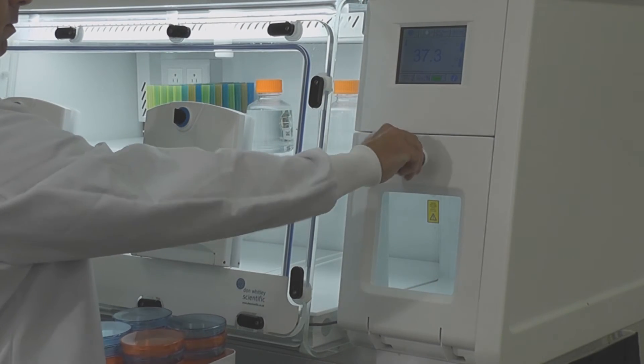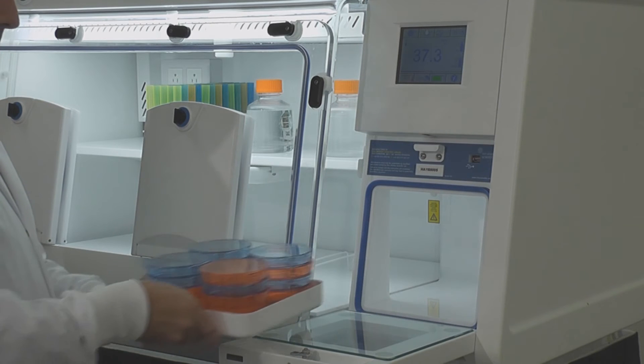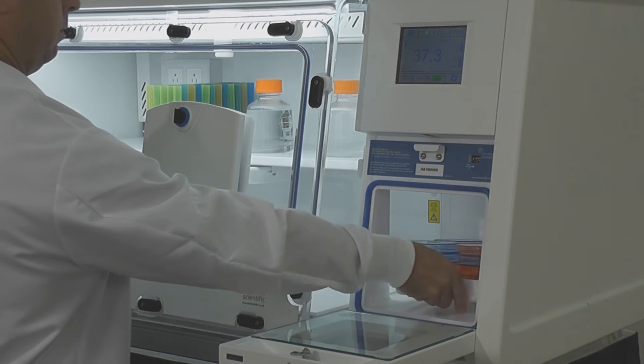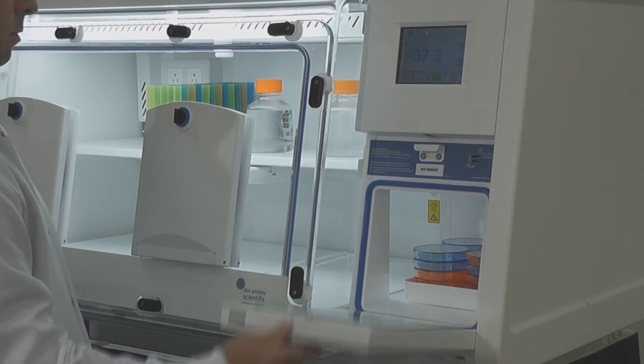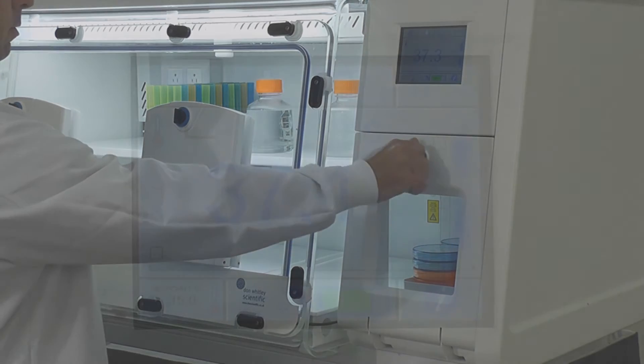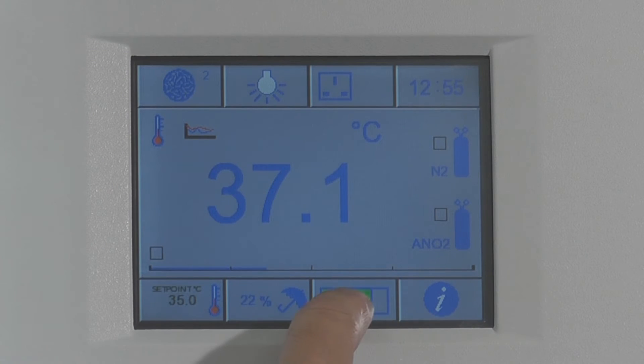Operating the airlock is very simple. Open the outer door and introduce your samples using the tray, then close the door. Initiate the airlock flush sequence by depressing the icon on the touch screen. After 60 seconds, the sequence is complete.